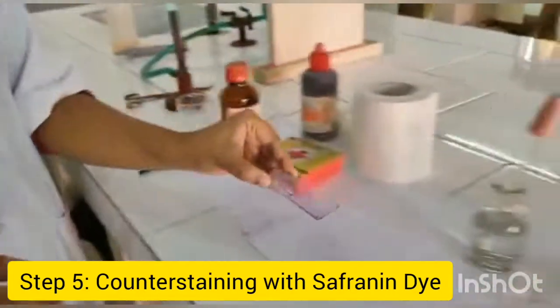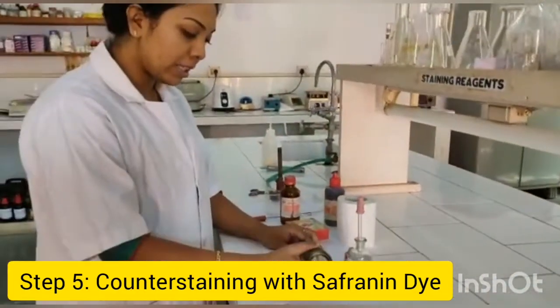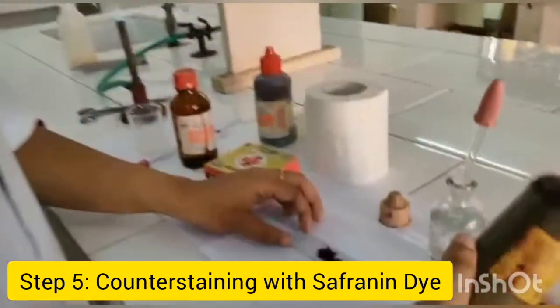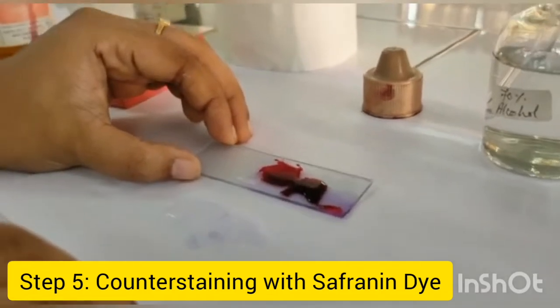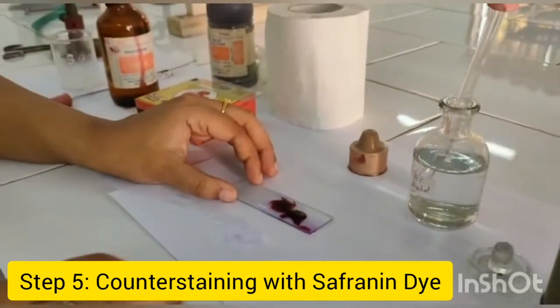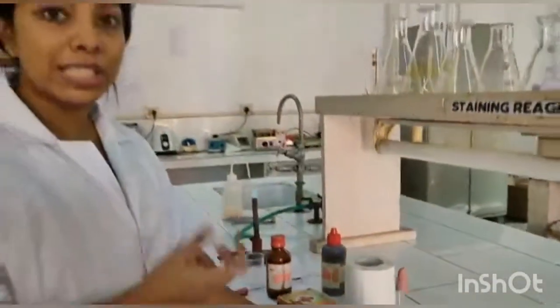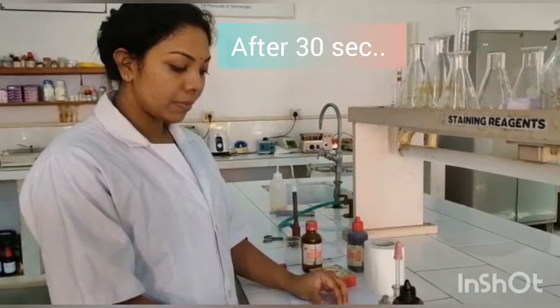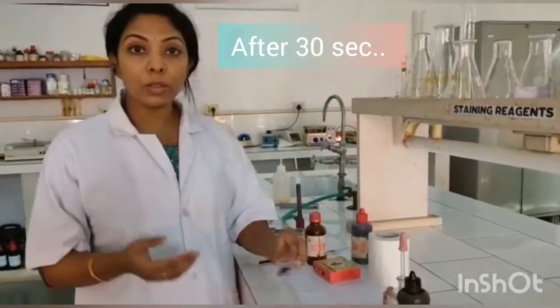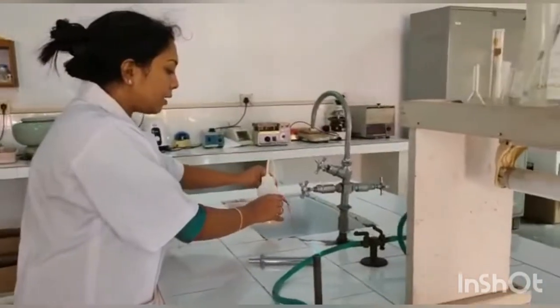Now we have to take our safranin and cover the smear again with the safranin dye. Wait for 1 minute. After 1 minute, you can wash it off and then view it under the microscope to see the stained organisms. The 1 minute is over now. Wash it off with clear water.